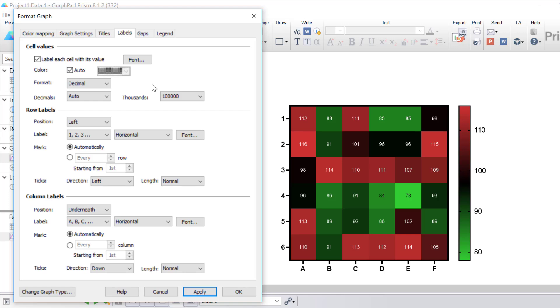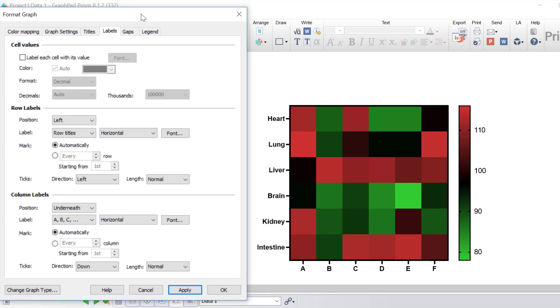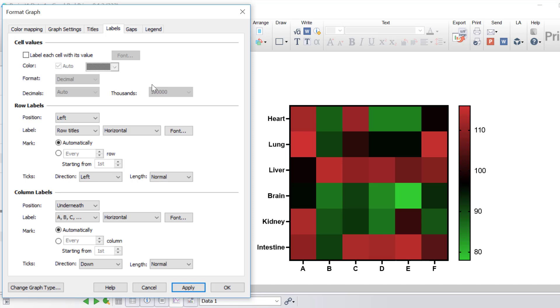Usually in gene expression heatmaps, cell labelling is not applied since the colour of the cell depicts the value, making it easy to visualise results when there are thousands of cells. Cell labelling may be useful if the heatmap is relatively small, or when creating a correlation matrix where you want to depict correlation coefficients. In this instance, I'm going to remove the labels within each cell. Under Row Labels, you can change the position and what the label actually is — so let's change this to row titles and click apply, so each row label now corresponds to the tissue type from the data table.